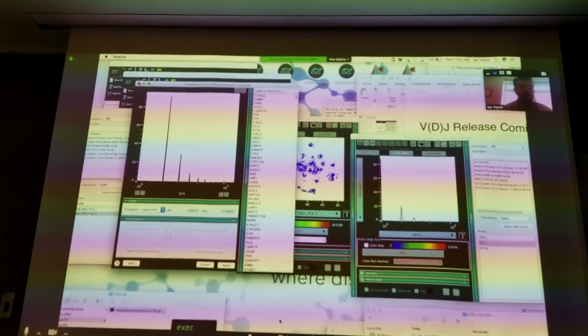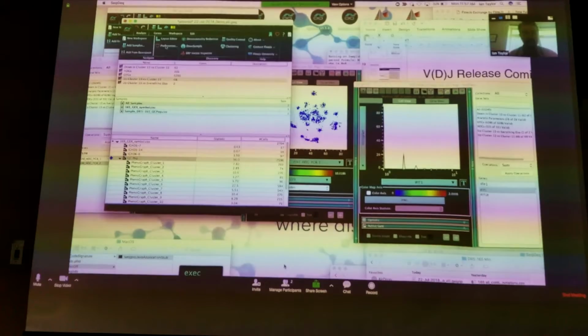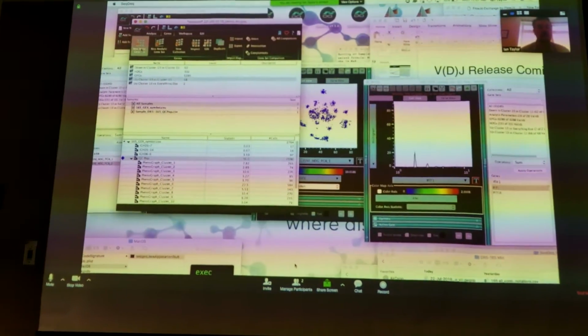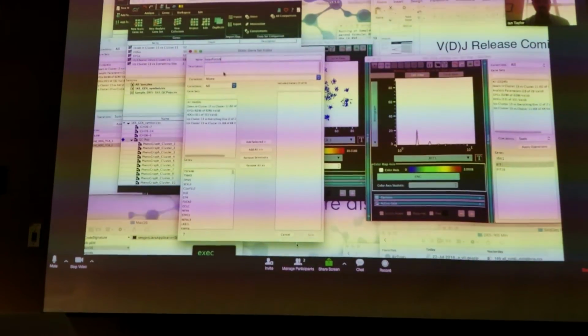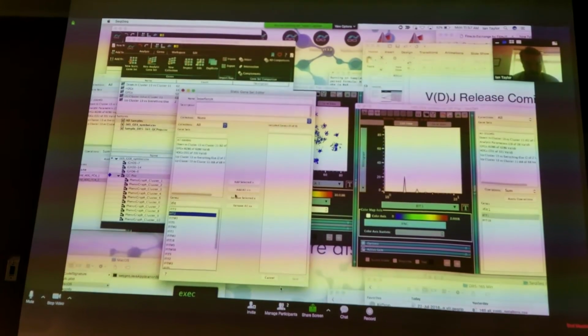And since we're just listing off lots of different genes, this might be an appropriate time to look at a gene set. So we could just scroll through a whole list of these. If I go to the Genes tab here and click on New Static Gene Set, I can create a new gene set. And I can start looking for IFIT2, that was one of them?